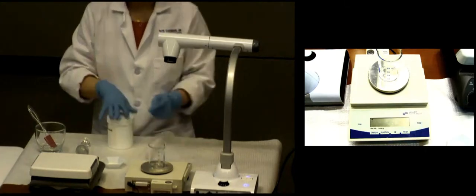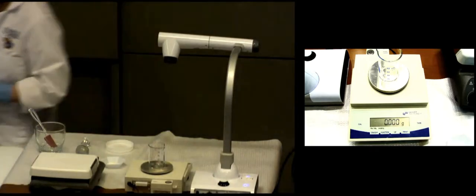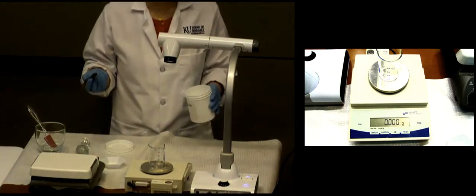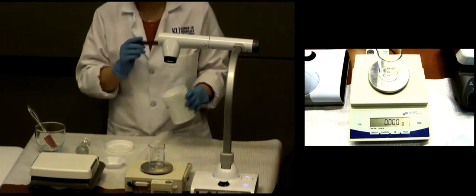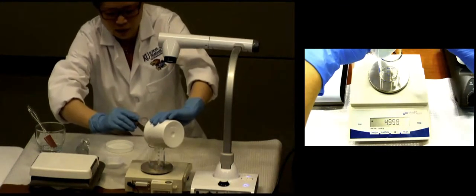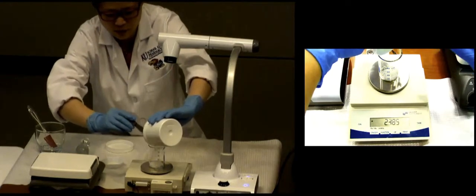All right, sweet. Okay, so we measured both ondansetron and indomethacin already. The only thing we haven't measured yet is fatty base. And you are going to measure into a 100 ml beaker directly. Okay, and what is my target weight here? The target: 16.577.